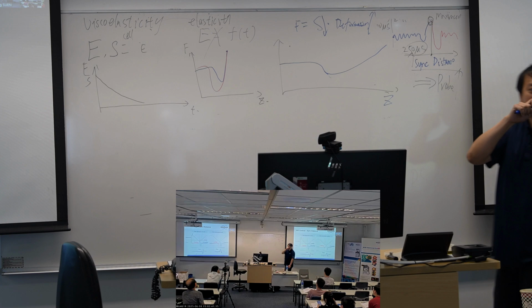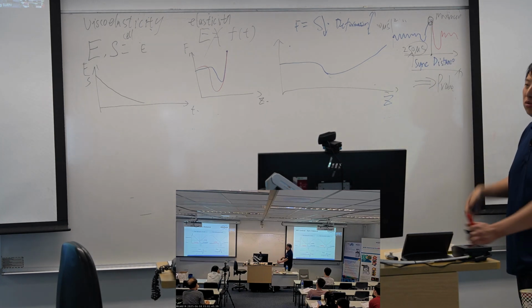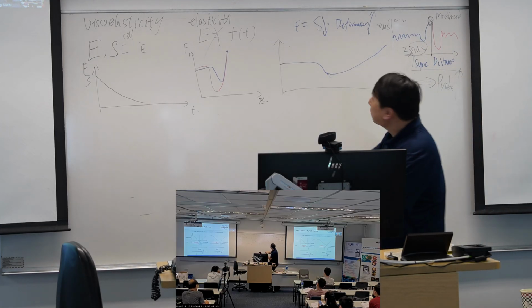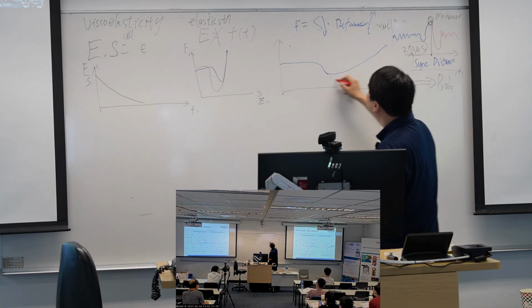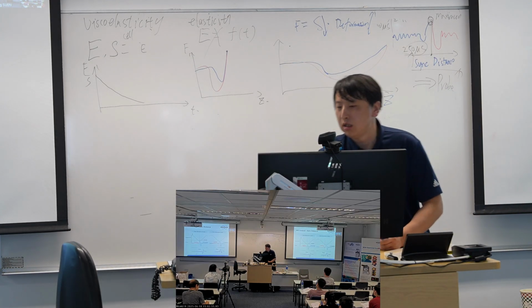And I think some researchers may see this kind of force curve many times when they are doing cell or gel samples. And then it will retract. Something like that. Okay?